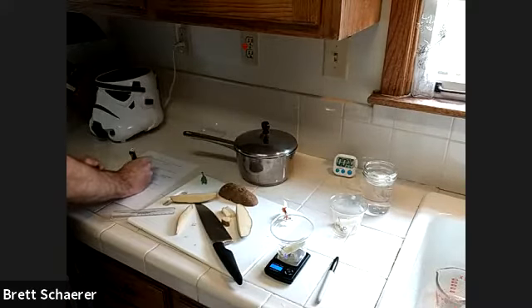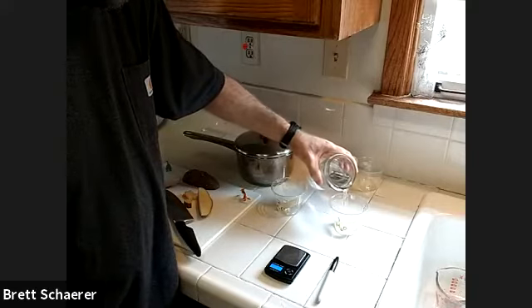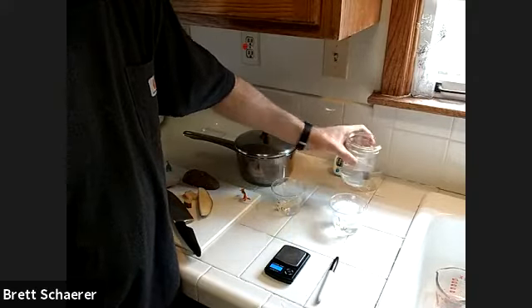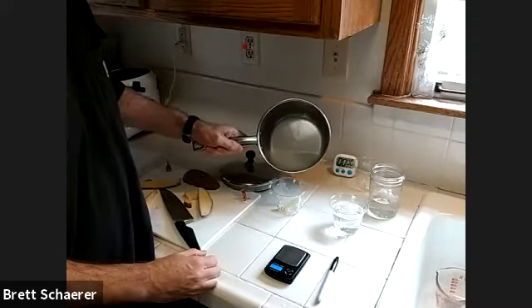Okay, so now we are ready to add the fluids and start the timer. I'm going to add just plain tap water that's also come to room temperature into this first container. And then in the second container, got the salt water here. It's okay if some of the salt comes out of solution, as it cools, it will still be plenty salty.